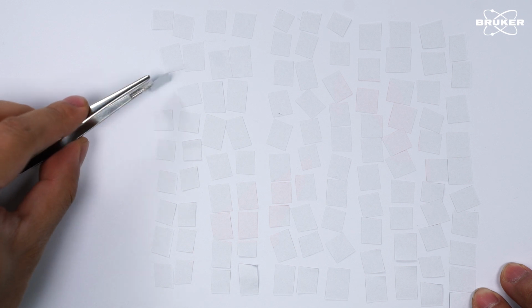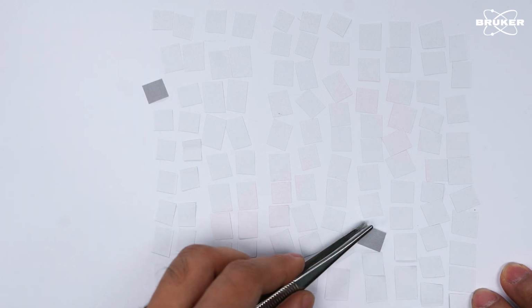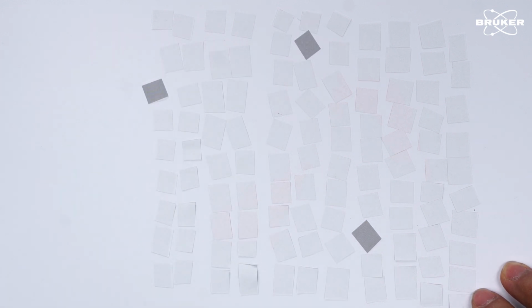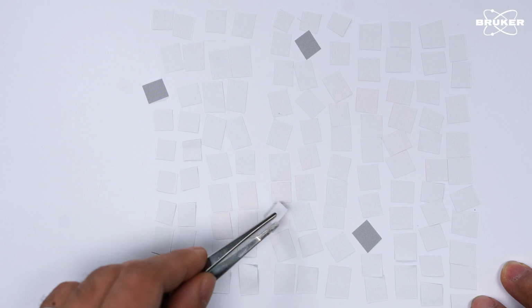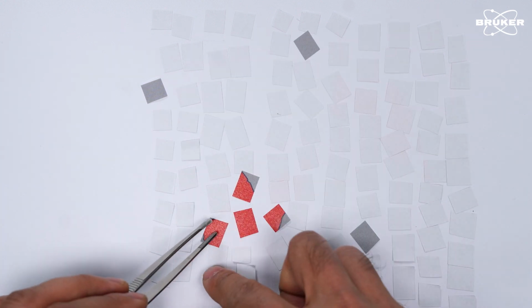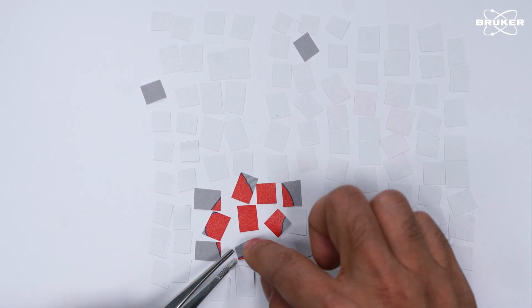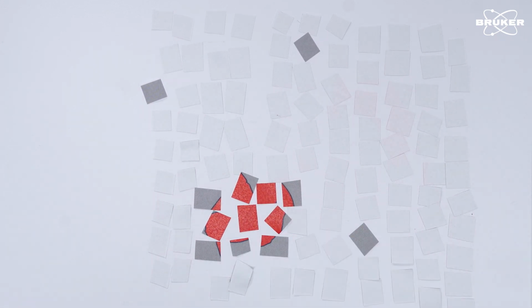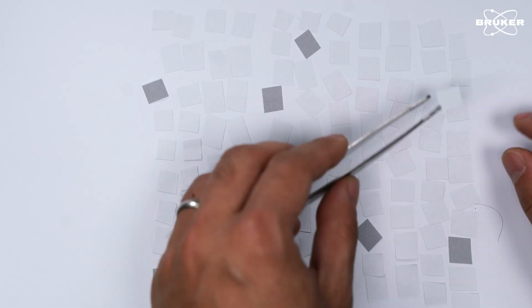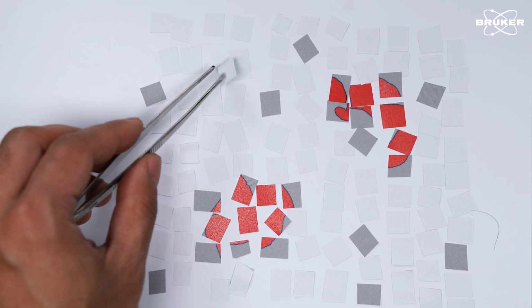Here's how it works. Let's say you are looking for a substance that shows up as red in your Raman data. You start by randomly measuring a few points across the sample. When you hit a red one, it makes sense to focus on that area, measuring points close to your find with a smaller step size and creating a high-resolution Raman image of that region. Then you go back to scanning randomly across the rest of the sample until you spot another red signal, and you zoom in again for detailed mapping.